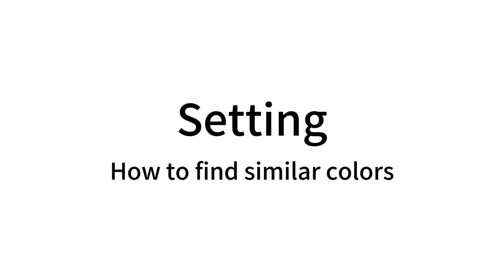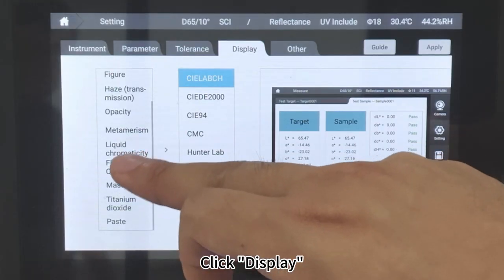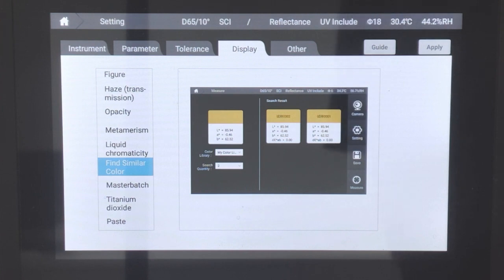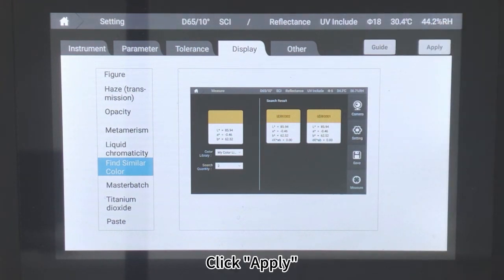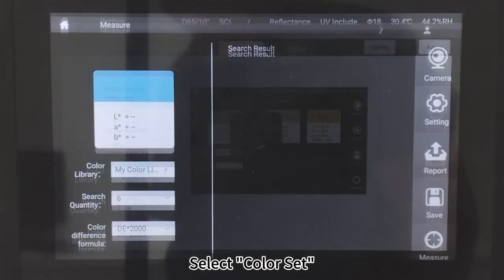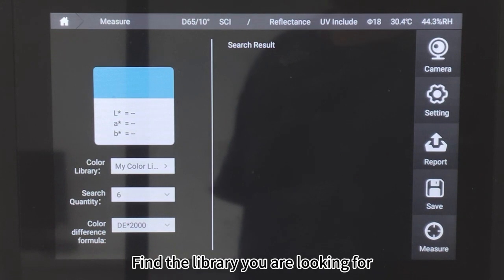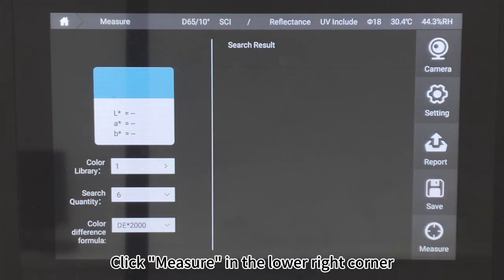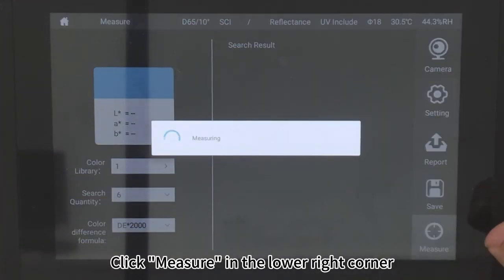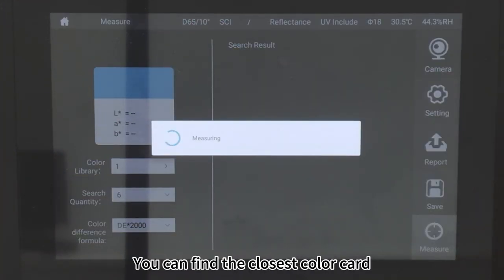How to find similar colors: Click Display, then click Find Similar Color. Click Apply, then select a color set and find the library you are looking for. Click Measure in the lower right corner and you can find the closest color card.